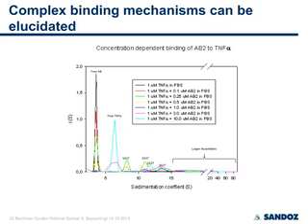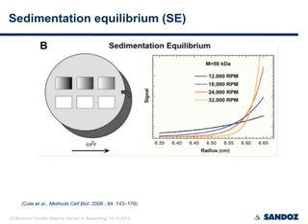Okay, now let's switch to sedimentation equilibrium for the rest of the time.